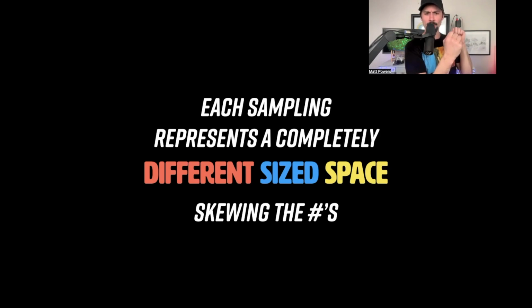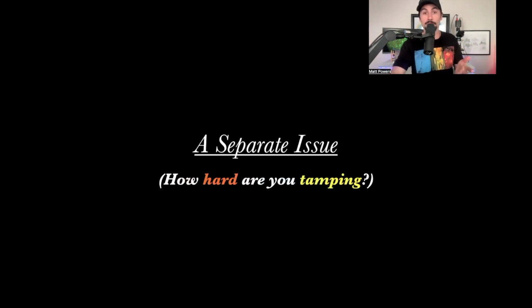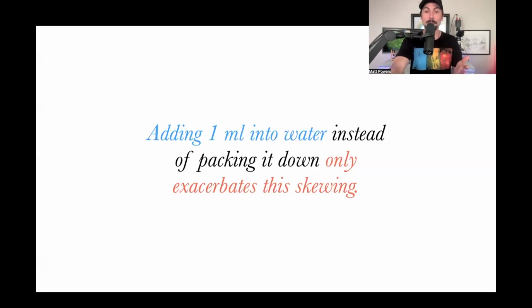So whenever we're comparing the dead soil with bacteria levels, and then we're talking about the loamy, the numbers with the way that I was taught and the way that most people are taught, well, unless you're taught by me, they don't work. And then how hard are you tamping, right? Some people are the master tampers and they're getting more air out than the other person. Not perfectly. No one's perfect. Can't get it all out unless you're displacing with water, but that actually makes it even more skewed. So a lot of people are taught add 1 ml.